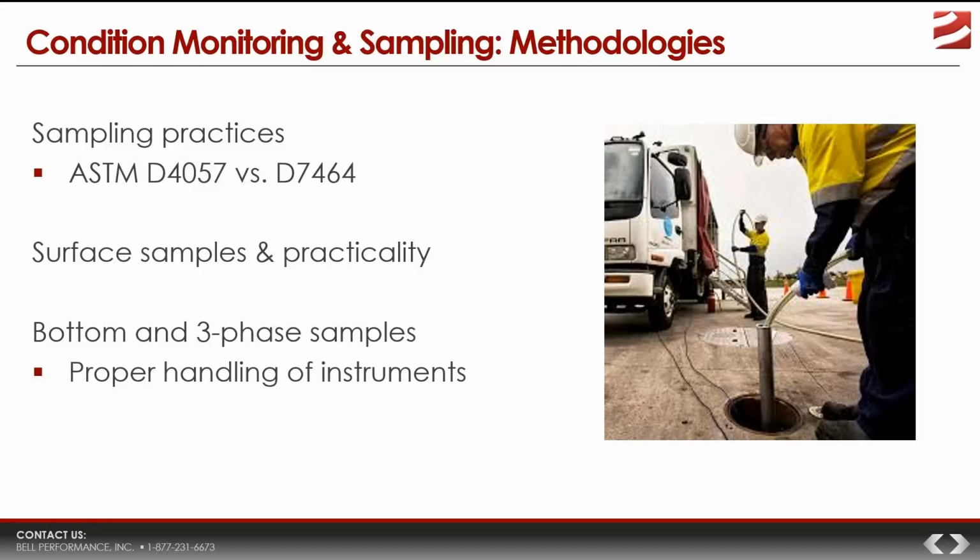Now, another consideration here, and this one speaks to testing protocols. When you're taking fuel samples, you want to make sure you sterilize your sampling tools, because if you don't, it is very easy to cross-contaminate samples and skew your results, and you will not know what's actually going on.